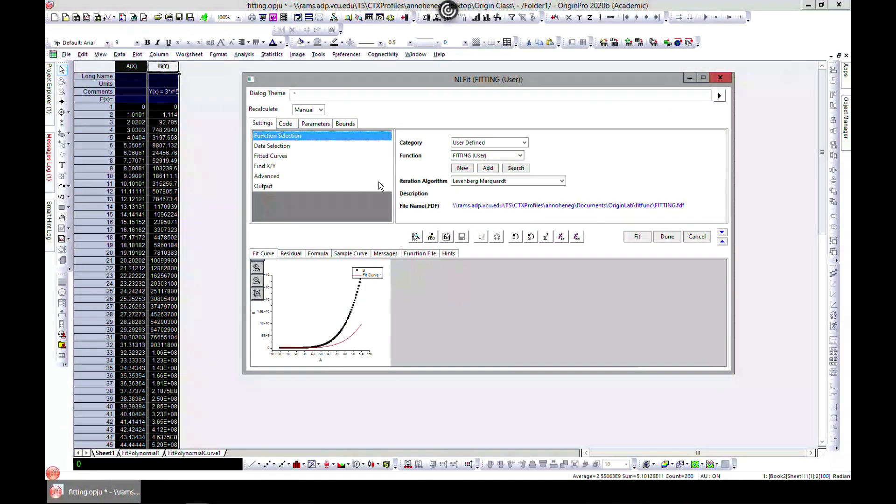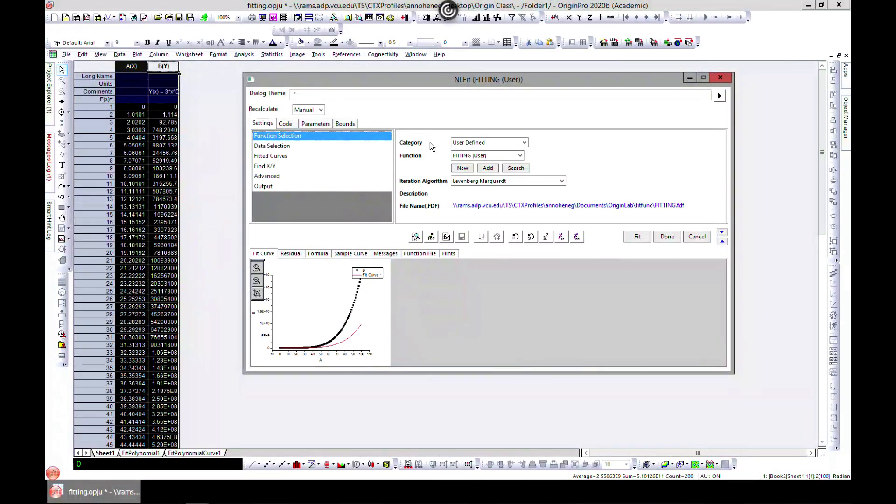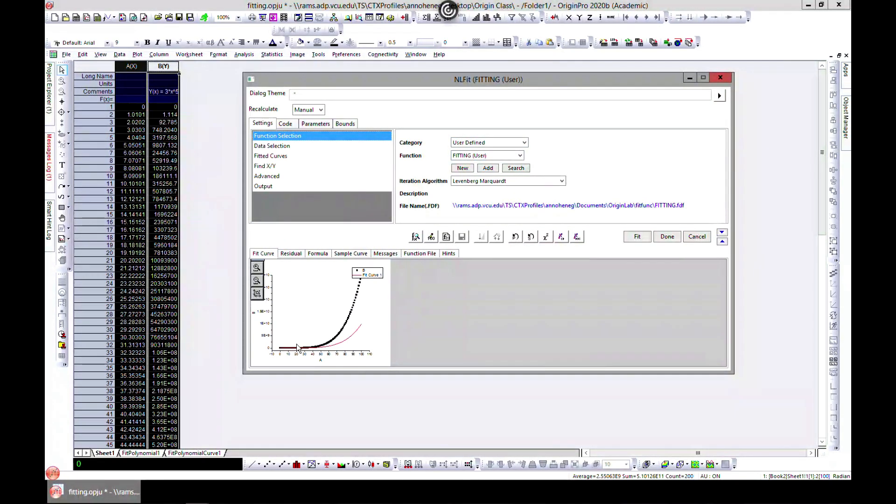Fitting is already chosen for us. Now we've added our own function and this is how it fits.